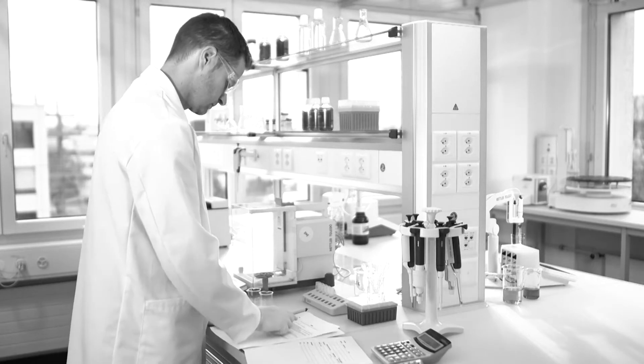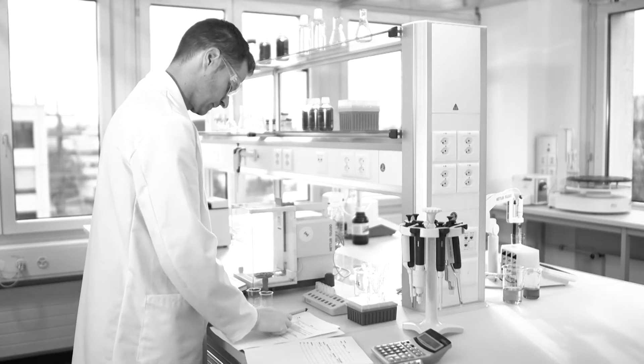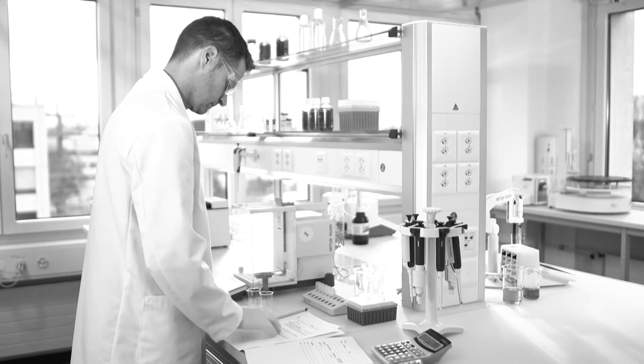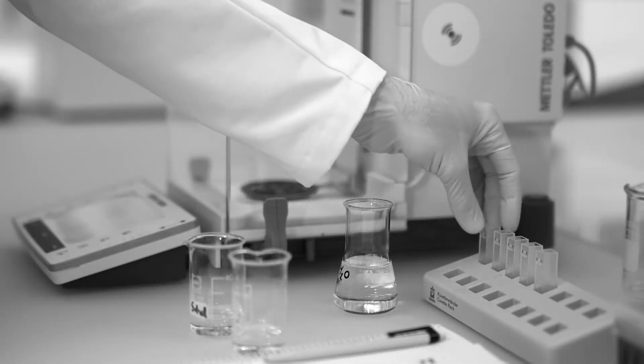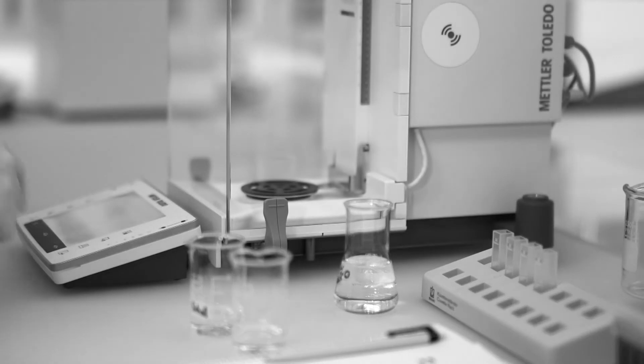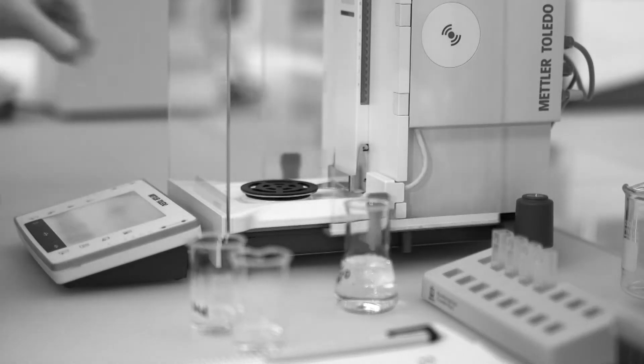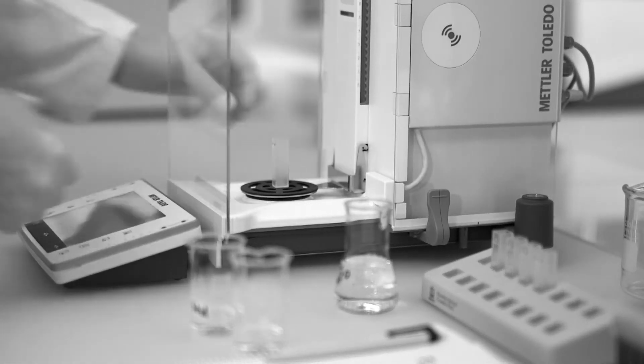For example, an SOP written on paper where the technician needs to accurately follow each step and calculations. Typically, work begins at instruments like balances and pH meters, preparing samples for other analytical instruments.